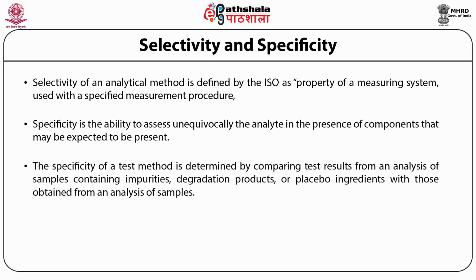The specificity of a test method is determined by comparing the test results from an analysis of a sample containing impurities, degradation products, or placebo ingredients with those obtained from the analysis of samples without impurities, degradation products, or placebo ingredients. Specificity can best be demonstrated by resolution between the analyte peak and other closely eluting peaks.